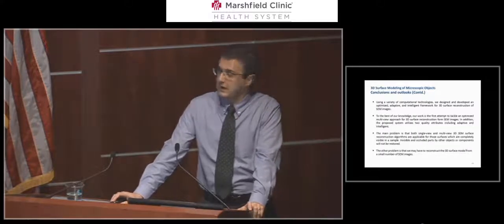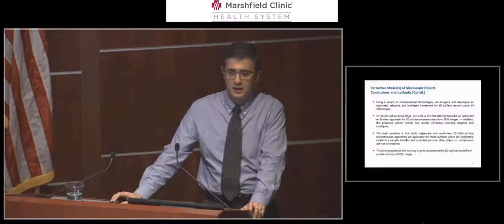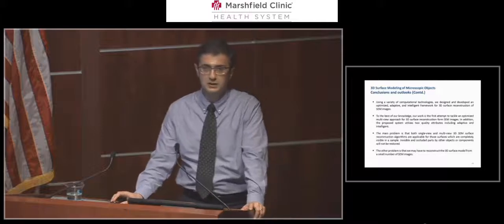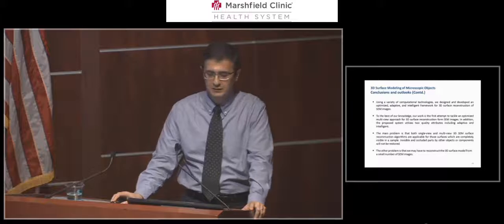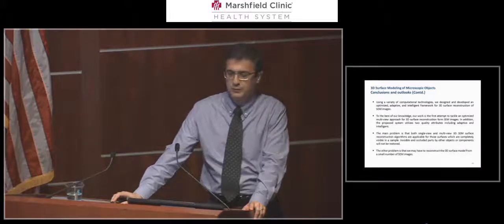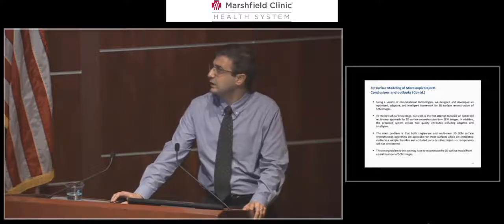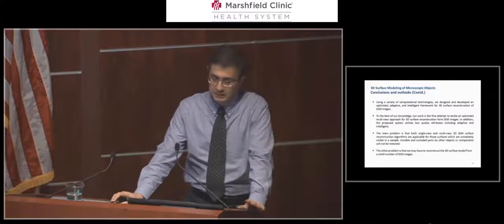In conclusion, we can say that using a variety of computational methods, we designed and developed an optimized, adaptive and intelligent strategy and framework for 3D SEM surface reconstruction. To the best of our knowledge, our work is the first attempt to tackle the optimized multi-view approach for 3D SEM surface reconstruction. The main problem is that both single view and multi-view 3D SEM surface reconstruction are applicable only to those surfaces that are visible in the images.